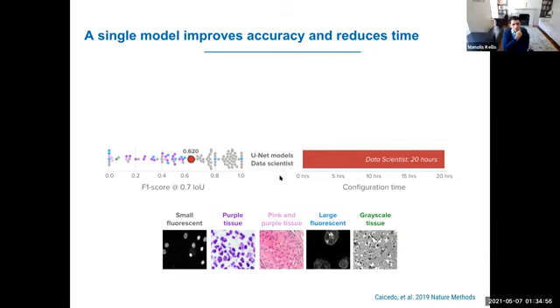So these images are harder to segment because you just don't have enough training for that type of image? Exactly. I think that's one of the issues in this specific data set. There is imbalance in the type of annotations that we get for each of the data sets, which kind of represents also the real world situation.